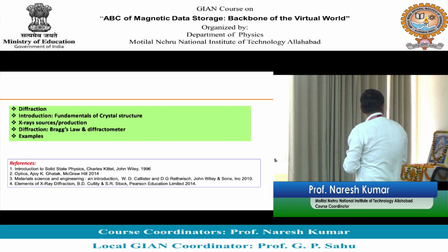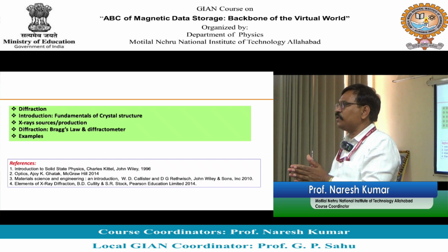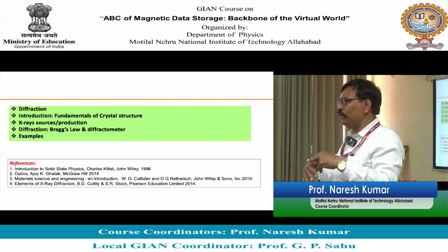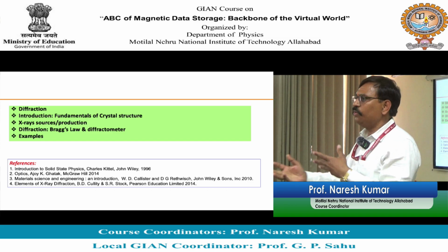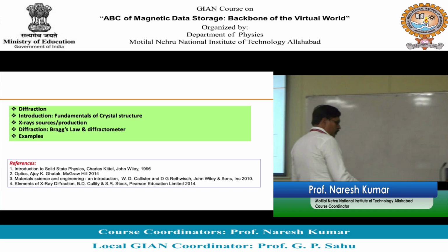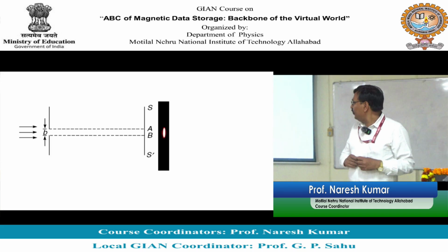So I am going to talk about this very important topic: determination of crystal structure, the study of crystal structure through X-ray diffraction. I will talk about the very fundamentals, and I will also take you to a little advanced version, where I will discuss how to index the X-ray data. So there are a few things to discuss. It's a very simple example or exercise.